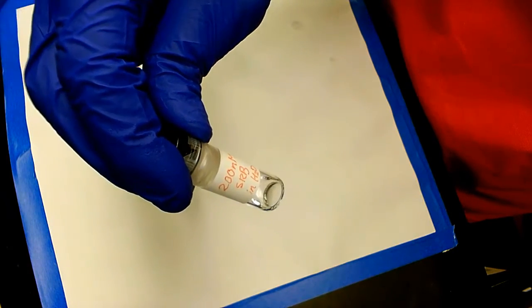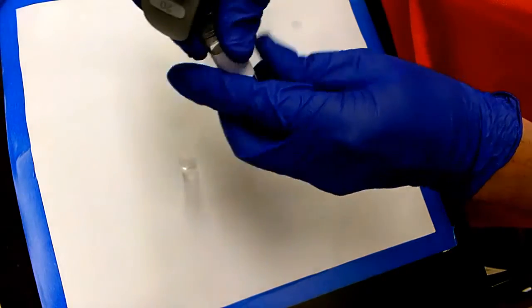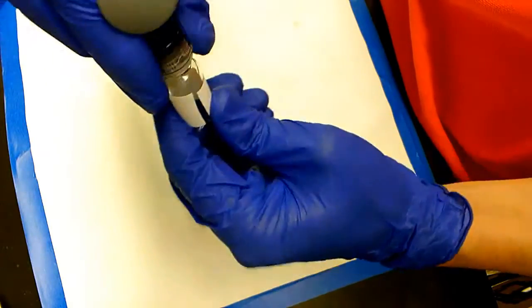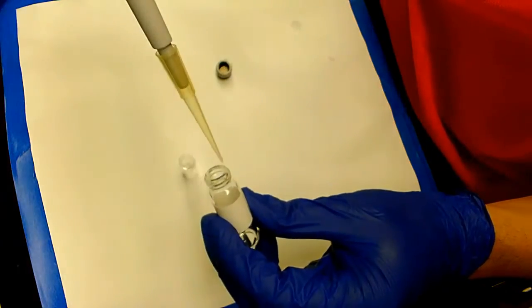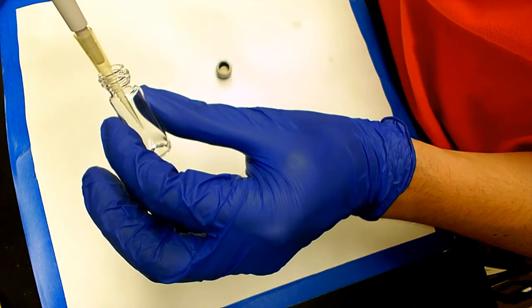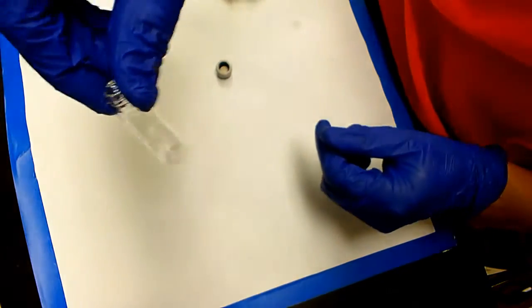And now I have here a 200 nanomolar SRB dye, and I'm gonna get 1 microliter out of this and dope that into your polymer, right? So I'm gonna get out 1 microliter of the dye solution, and I'm gonna add that into the polymer stock, like that, and go all the way in, and then mix this one a little bit.